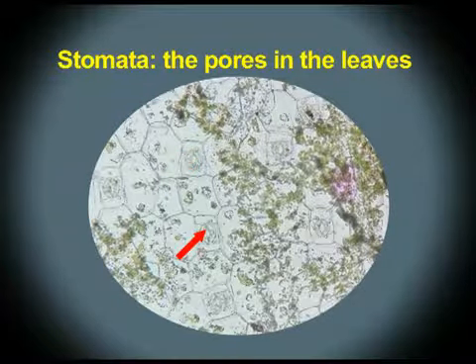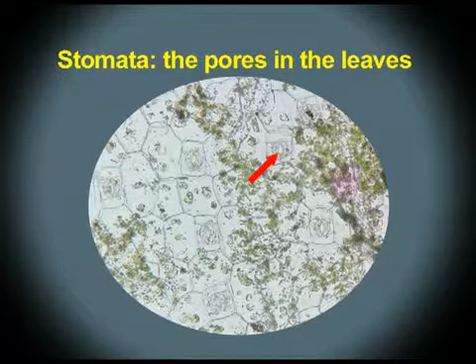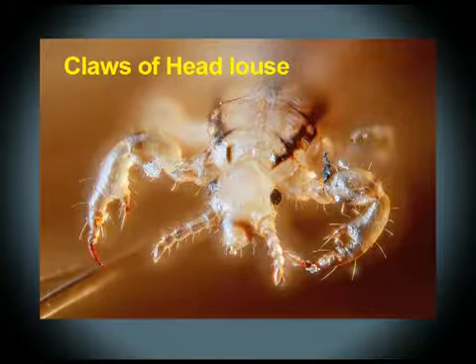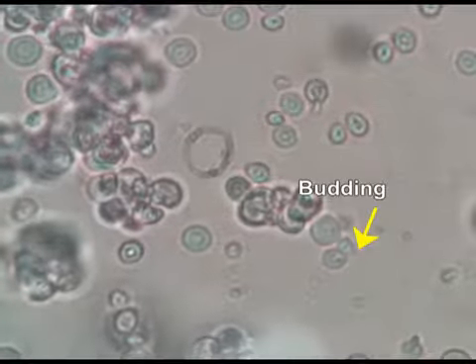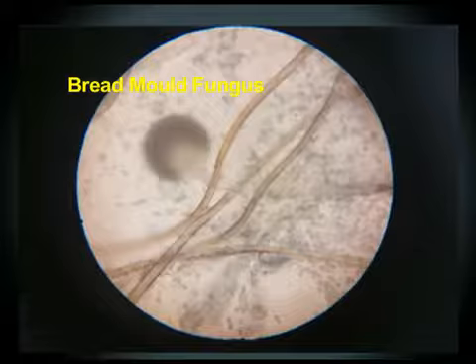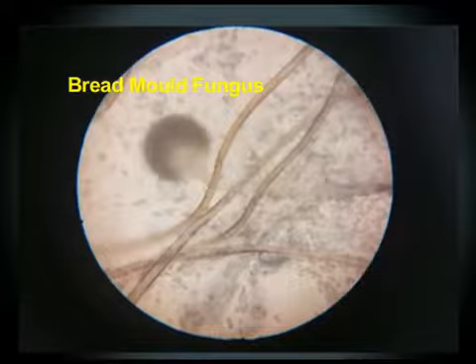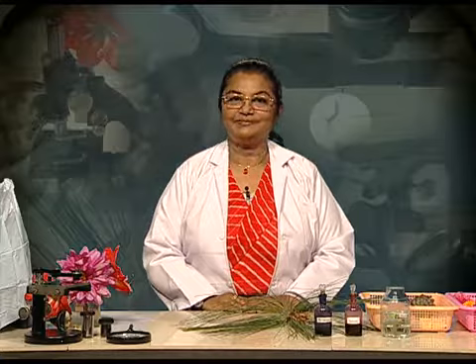Stomata, the minute pores present in the surface of the leaves for exchange of gases. The deadly-looking claws of a head louse. Reproduction in yeast by budding. Thread and pinhead-like structures that can be seen only under the microscope of bread mold fungus. Don't they look amazing when viewed through the microscope?